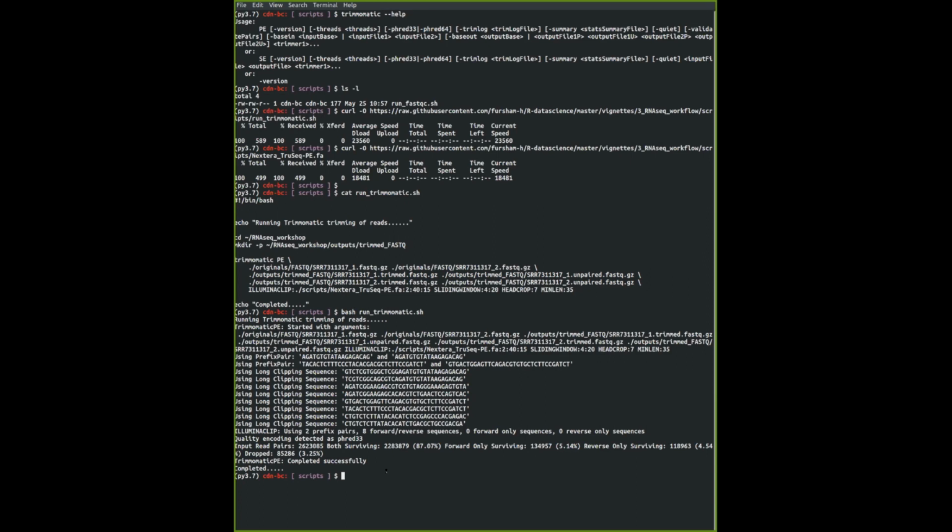Let's do a little bit of exercise. I know it's about 11:44 right now. It's not going to take too long after this. Run FastQC on this new set of FastQ files. I pasted the exercise in Etherpad. Basically, there are 3 things that you have to do.